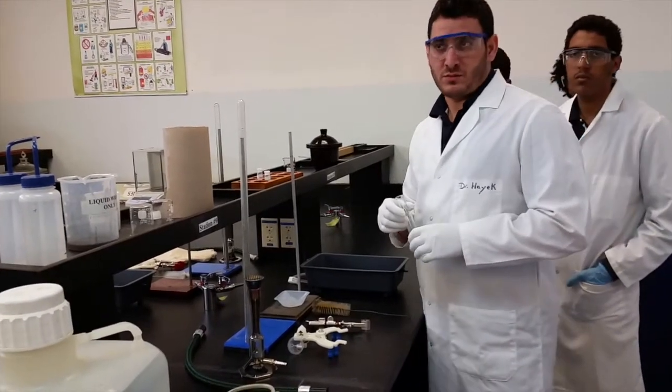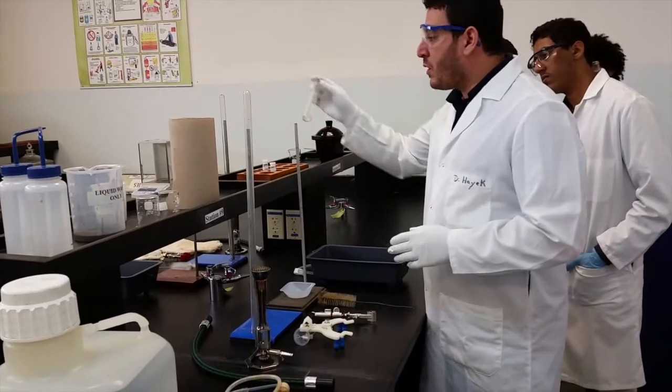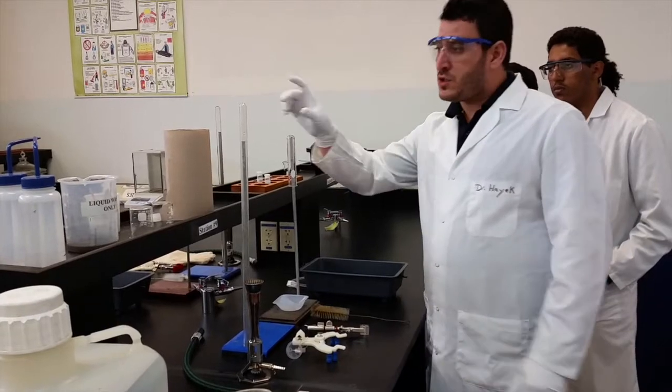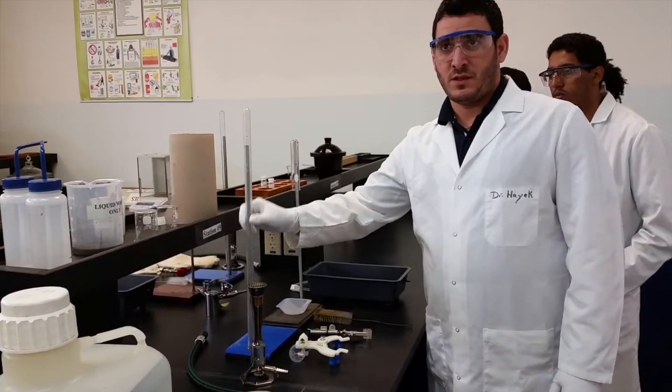Today we will combine these two experiments, but we have to know the quantity of copper carbonate that we used, and also we will measure the quantity of gas that will form.